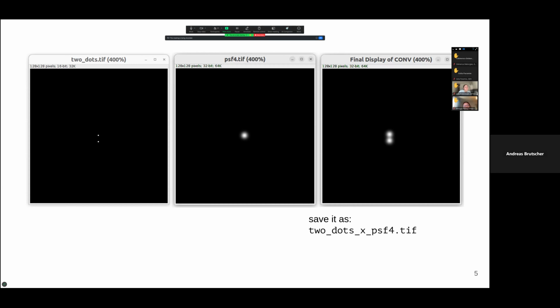Sorry, I didn't understand what we had to put in PSF. So on the PSF, you take the PSF4.tiff. So it's one of the provided images. Okay, thanks.